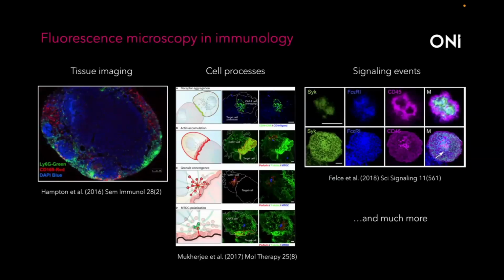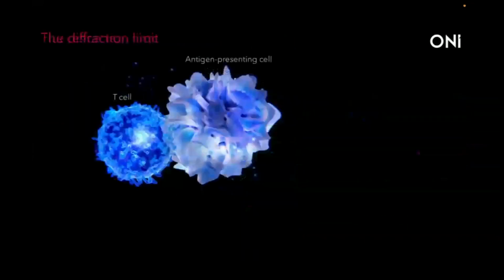As I say, fluorescence has also made a massive impact in immunology through flow cytometry. And there is imaging flow cytometry, which is making something of an impact in the field, but is limited a bit by the resolution, because it is very much the number of cells that you're imaging rather than the individual quality of each cell. So what's the problem?